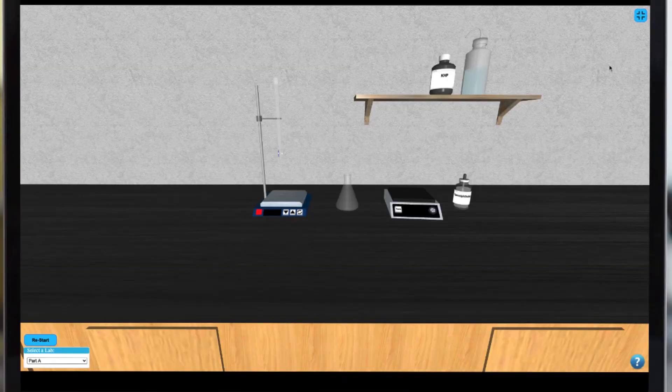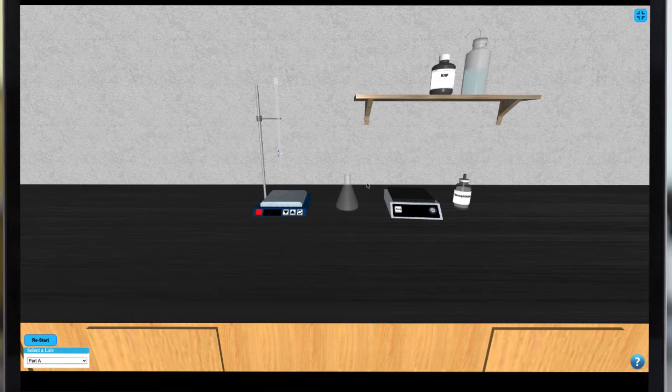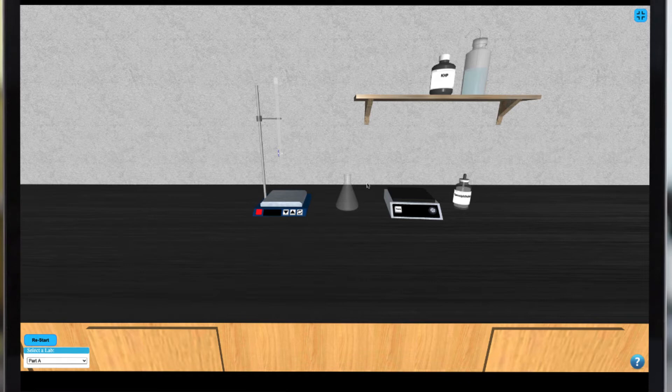In each part of this simulation you'll be performing a titration. To do so, place the appropriate sample in your Erlenmeyer flask by clicking on them.